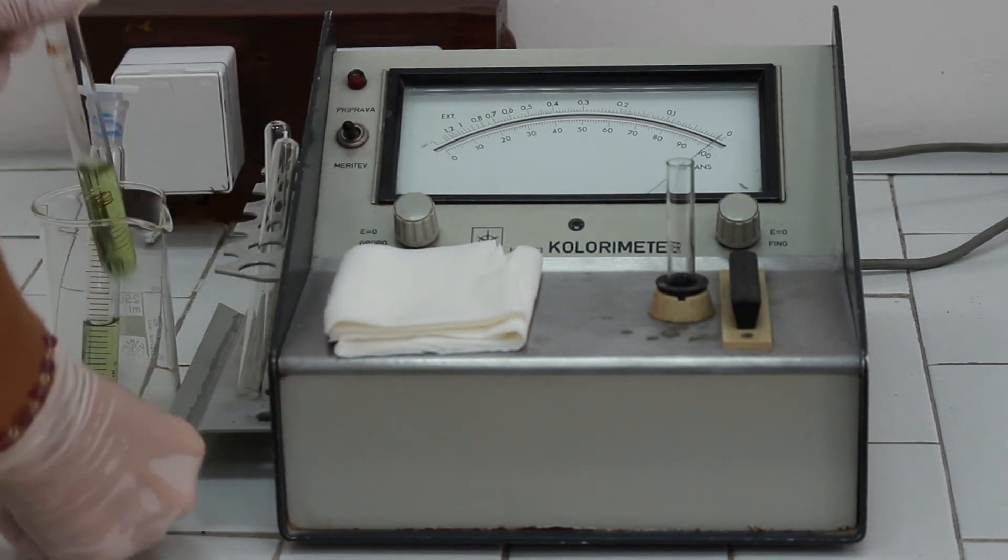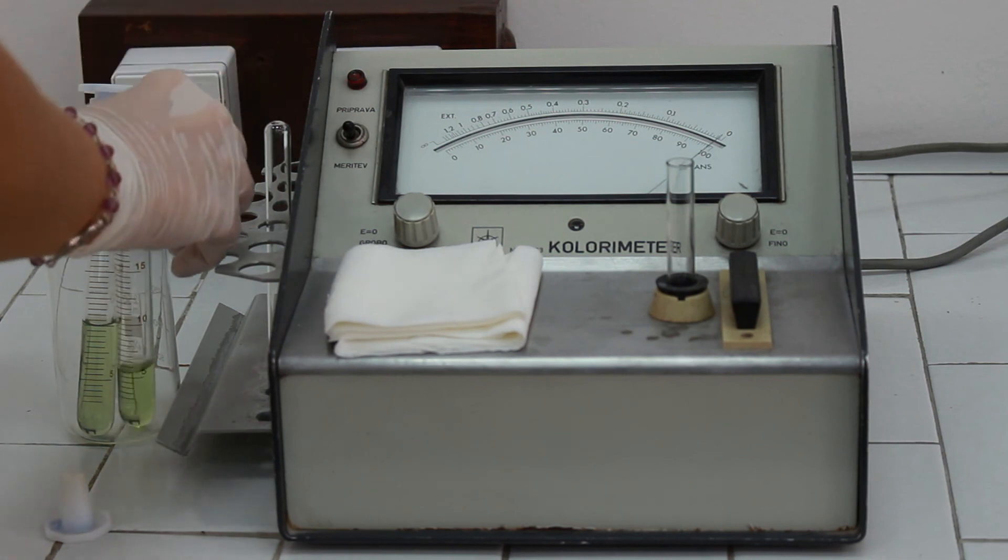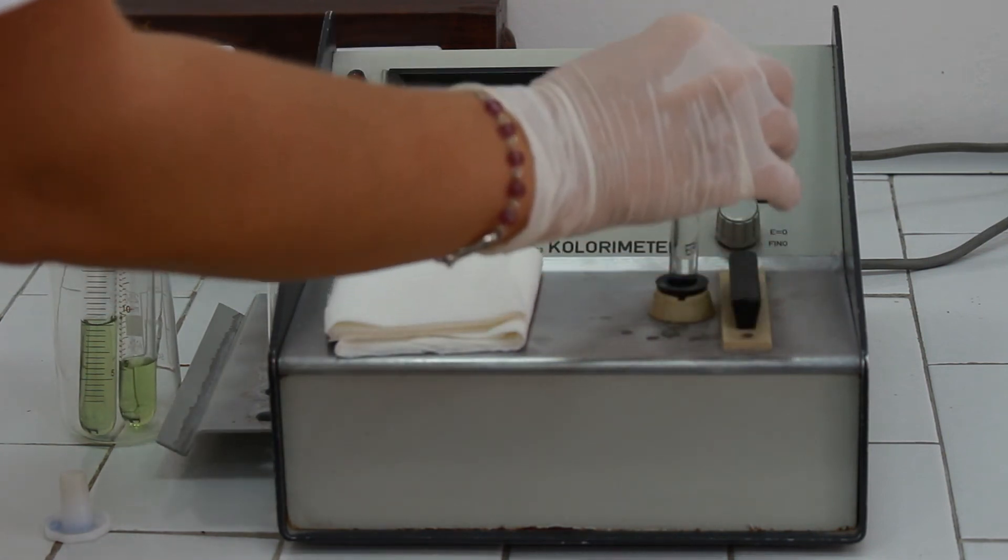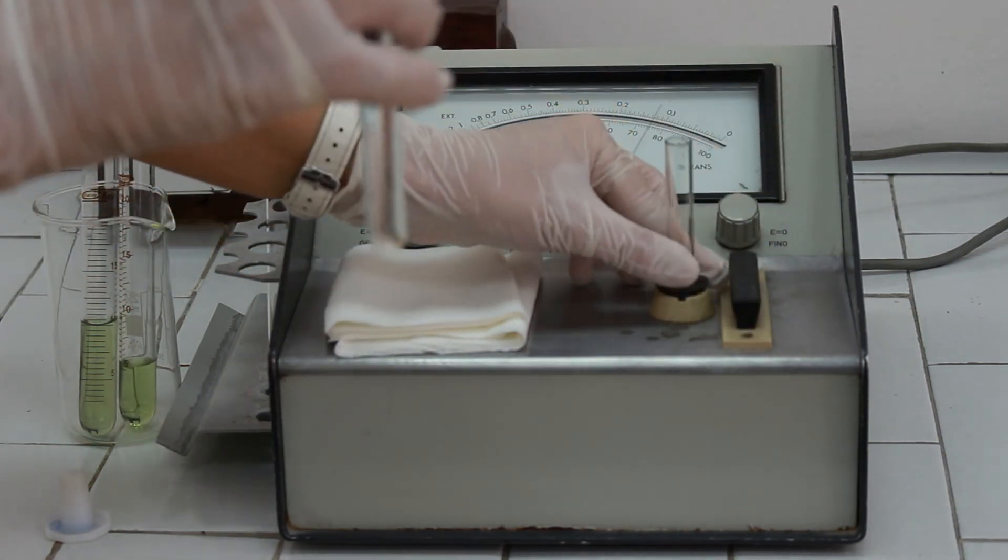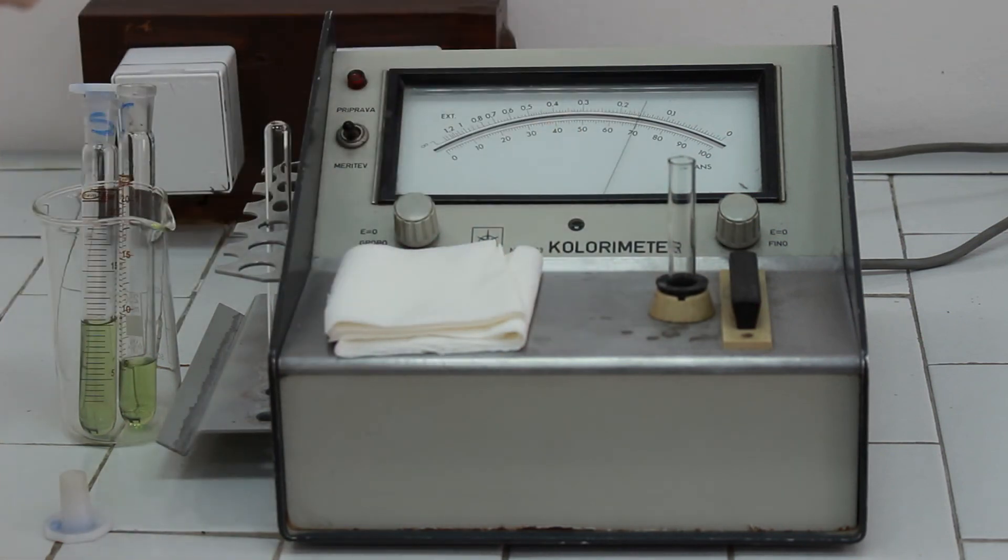And the right wheel is for the fine adjustments. When we did that, we are going to pour our test solution to another cuvette. Switch places with the blank solution and read the absorbance.